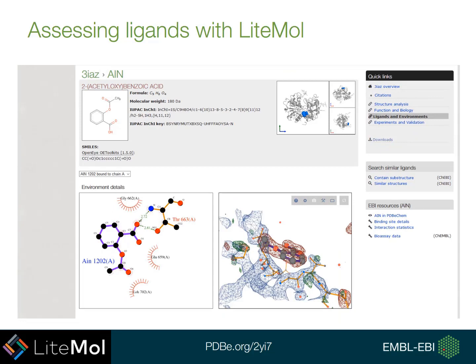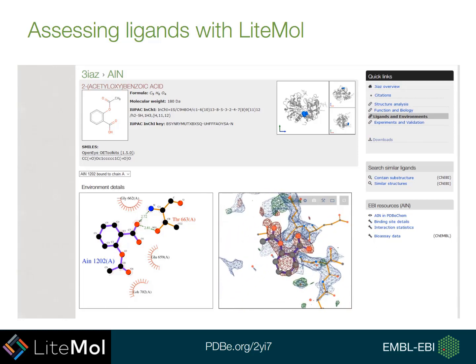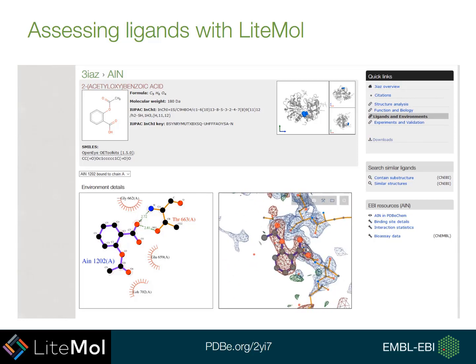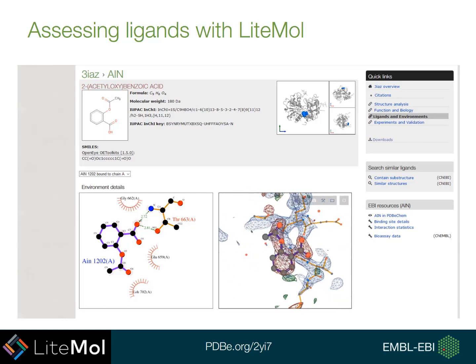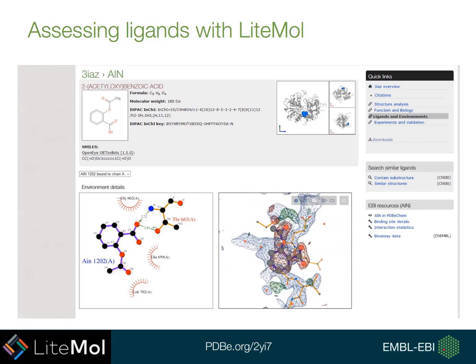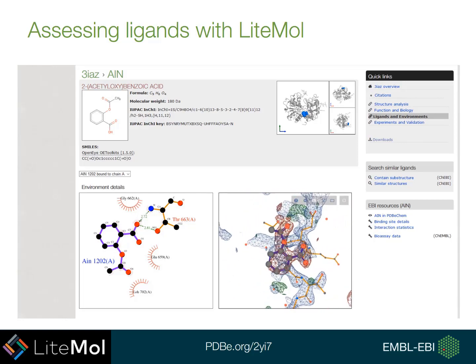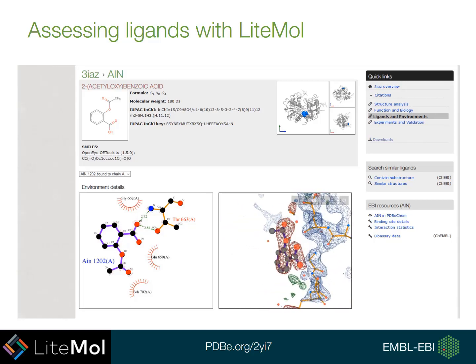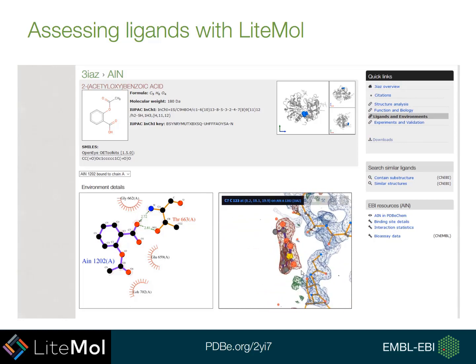Here's an example of how you might assess ligands using Lightmole. For entry 3IAZ and the ligand AIN, you can see in the Lightmole viewer that there's a lot of red density surrounding this ligand. This suggests that there's not much data to back up the modelling of this ligand, which is something important to bear in mind when you're looking at ligands.